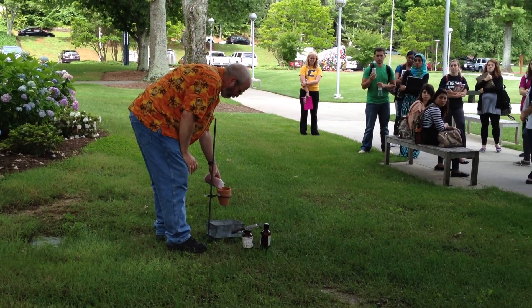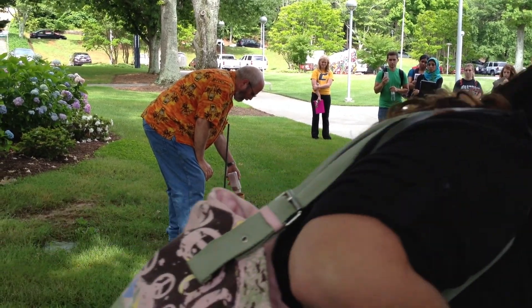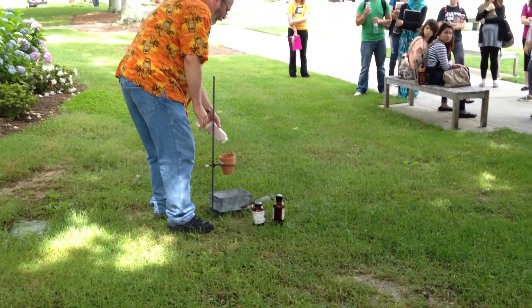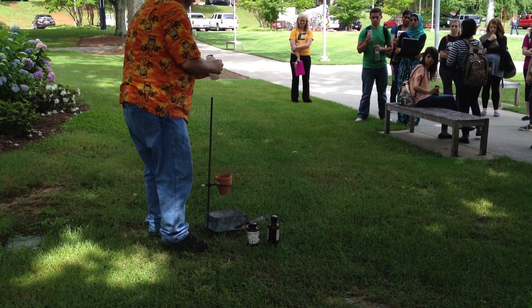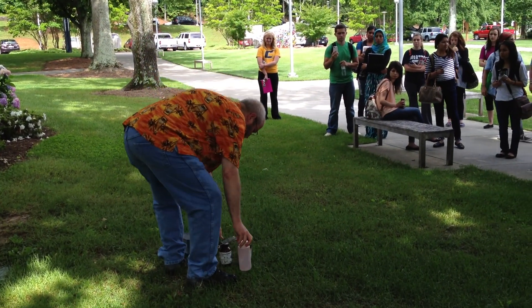We'll pour it into here. I use these terracotta pots because plastic will melt and metal will crack. The terracotta will crack too, but it'll hold together enough for the reaction to go. I can only use them once, though.